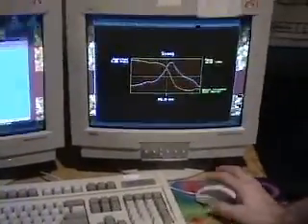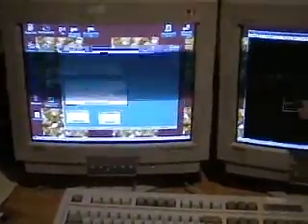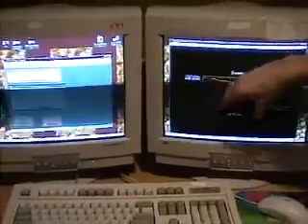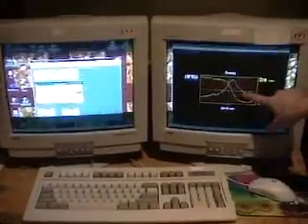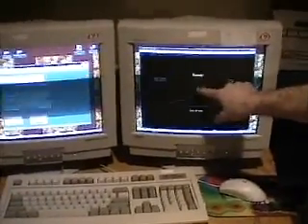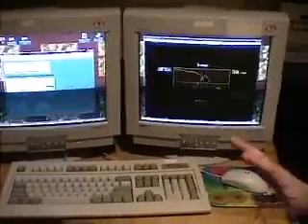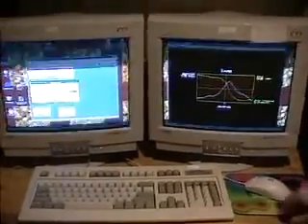And so in order to tap the sample more lightly, I'm going to increase this amplitude set point, which is basically going to have the effect of moving this green line up, or equivalently moving the whole white trace down, which is what it's going to look like. So right now this is set at 1 volt. I'm going to move it up to, let's try 1.3 volts. And when I hit enter, you'll see this whole thing jumps down by a little bit. And that's a more reasonable reduction in amplitude. It's a little bit less than a factor of 2. So that looks pretty good. We're going to adjust it more precisely later, but I like to have it roughly looking like this.